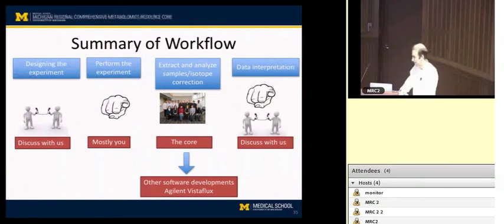Right. So MSMS can sometimes give you a little bit of information about isotopic position. If you get a fragment that has certain carbons on it, and you know what those carbons are, then you may be able to get a little bit of data about which carbons are labeled. What you can't usually do, with LC-MSMS fragmentation, is this: generally we'll get one or maybe two fragments from a given metabolite that are abundant enough to really do a good job quantitating. We won't get a unique fragment that has every single carbon in a molecule.